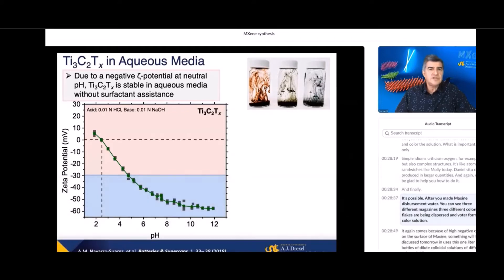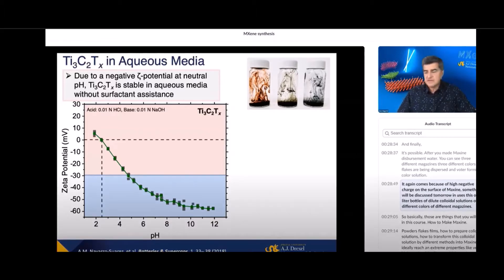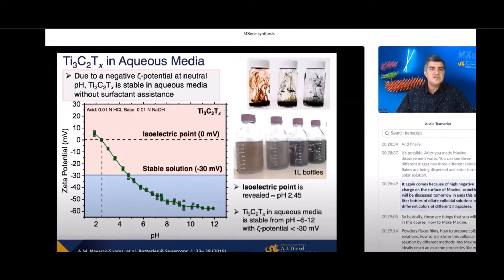MXene, three different colors and flakes are being dispersed in water forming colloidal solution. It again comes because of high negative charge on the surface of MXene. You see these one liter bottles of dilute colloidal solutions of different colors of different MXenes.